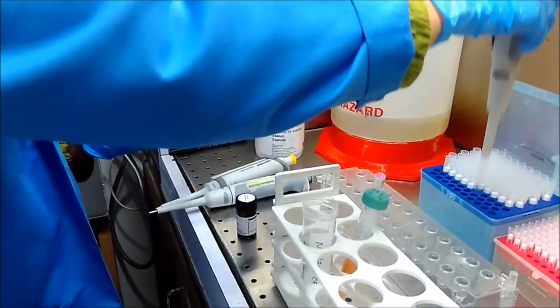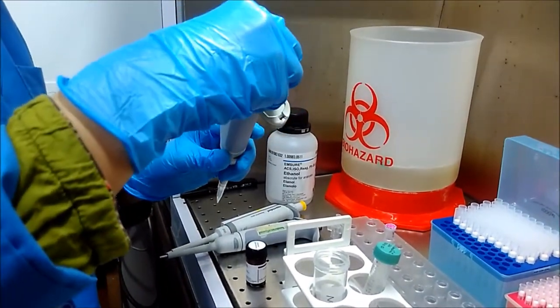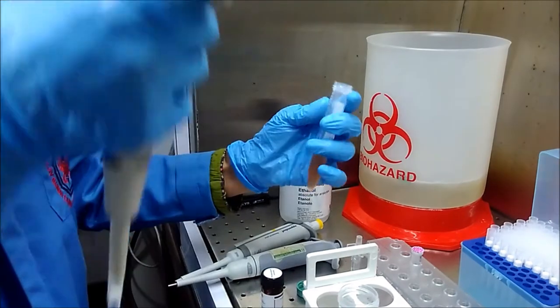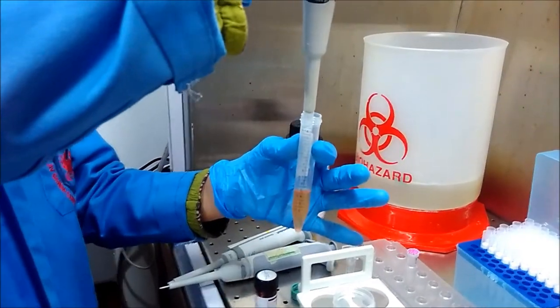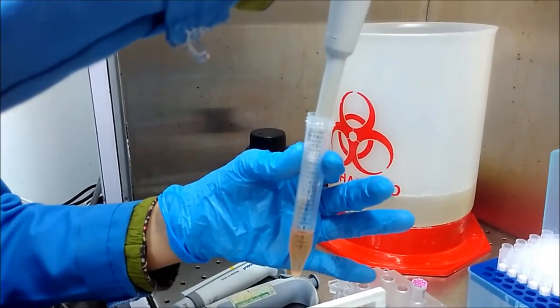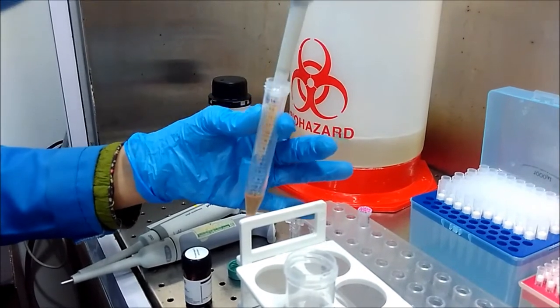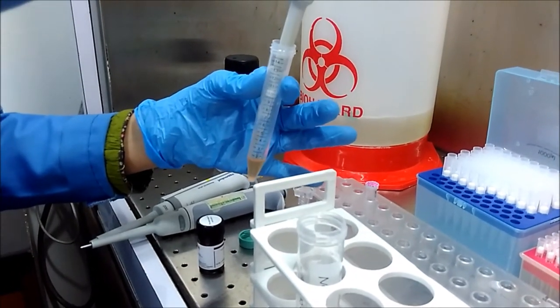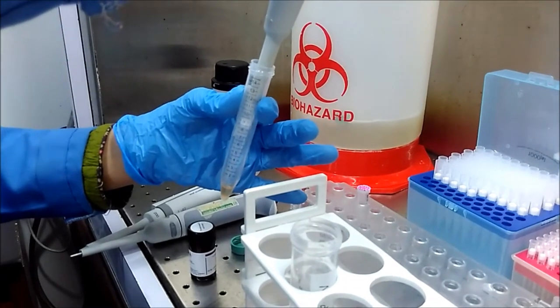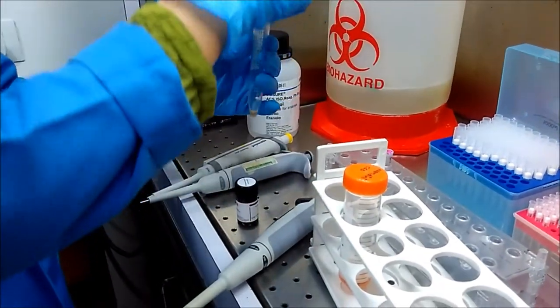We have a centrifuged sample that we have already spun at 16,000 G for 10 minutes. We have plasma as the supernatant, and all the debris and WBCs are at the bottom. We will not involve our WBCs — only the plasma supernatant. I am adding 4 ml of plasma sample to the proteinase K, then vortexing to properly mix everything.